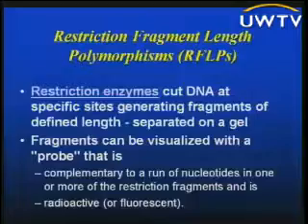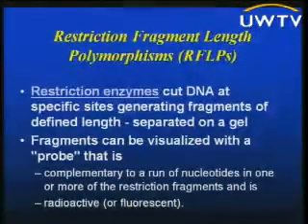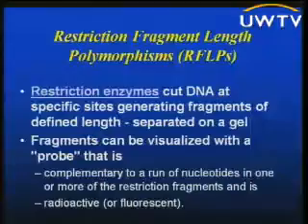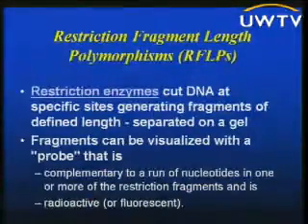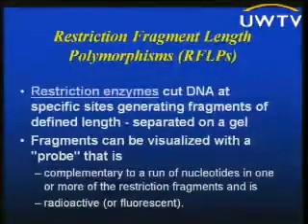So briefly to discuss restriction fragment length polymorphisms, which were first introduced by Sir Jeffreys in 1985, I think, and then was essentially the only DNA test in use for genomic DNA for at least until the mid-90s. And it's a crude assay. It's got a few caveats associated with it, but at the time it was state of the art.